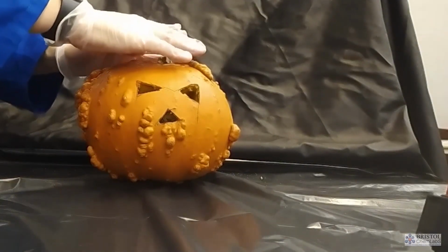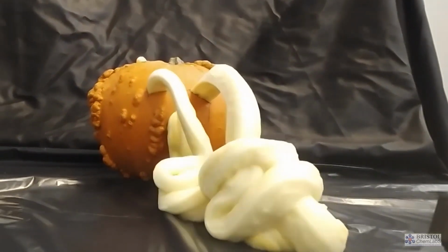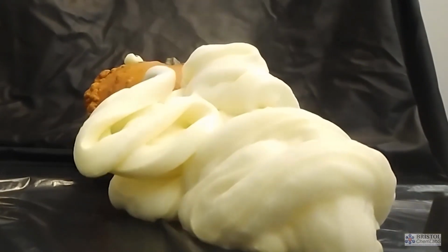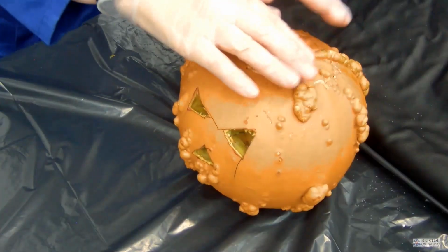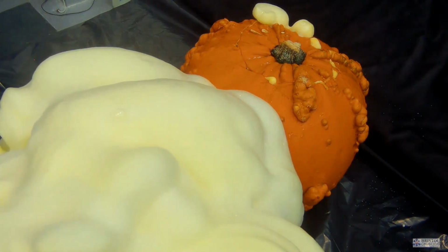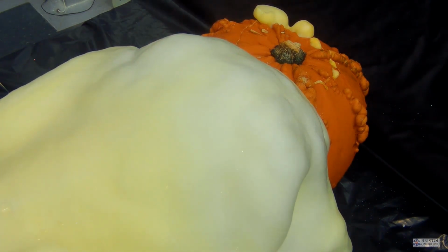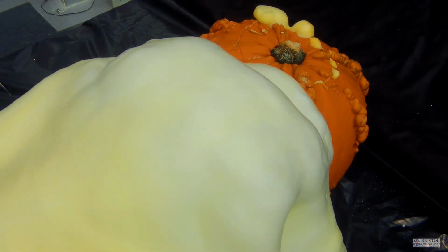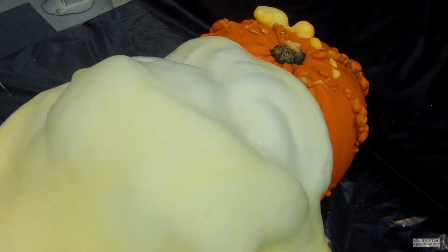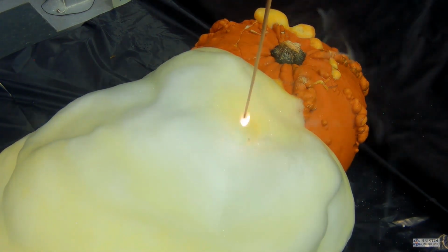In the reaction just seen, we used concentrated sulfuric acid to start the reaction, a redox reaction. Here we're using potassium iodide to speed up the decomposition of hydrogen peroxide to water and oxygen. This redox reaction occurs very slowly at room temperature, but the catalyst, which is actually the iodide ion, speeds up the reaction with a pleasing effect if situated in a pumpkin. The presence of oxygen can be shown with the relighting of a glowing splint.